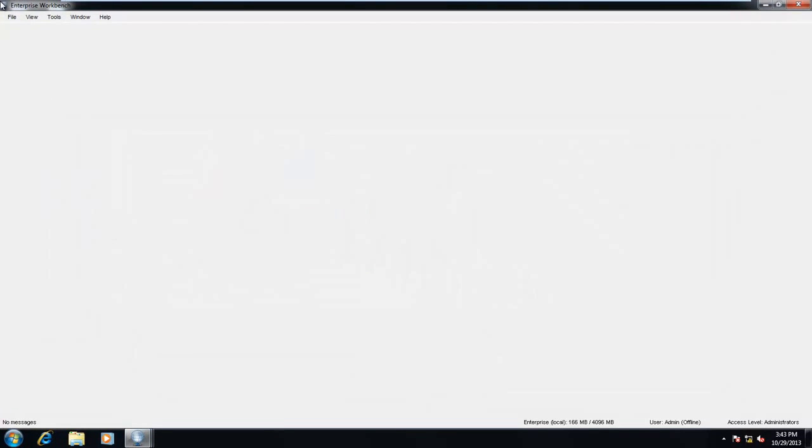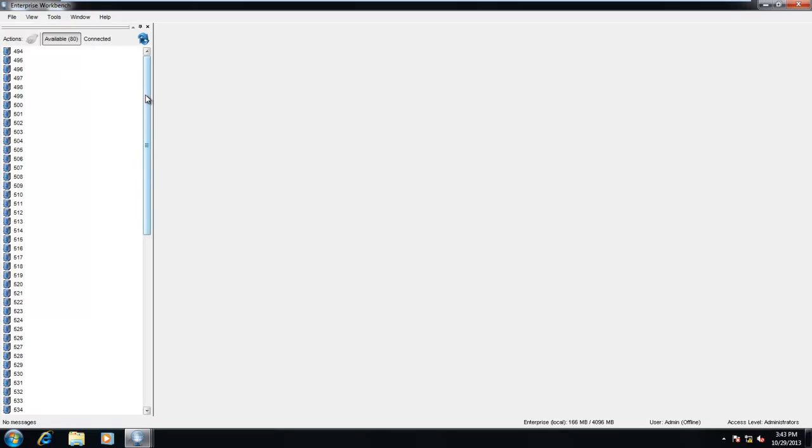Once our authenticated user is into the system, we'll elect to view all instruments on our network and select the plugin we wish to work with. In this example, we're going to choose a PMD 110, or Portable Micro Distillation Unit from ISL.